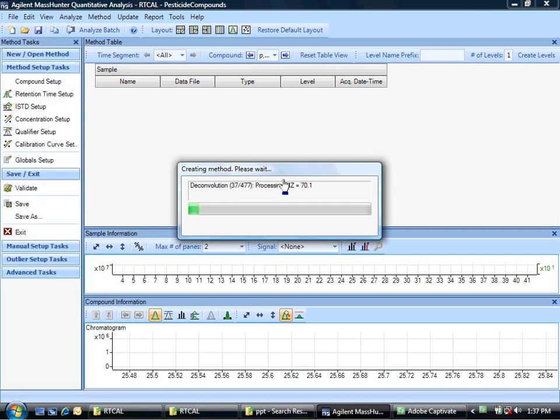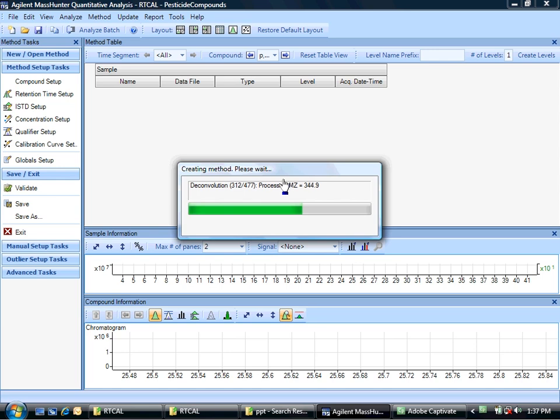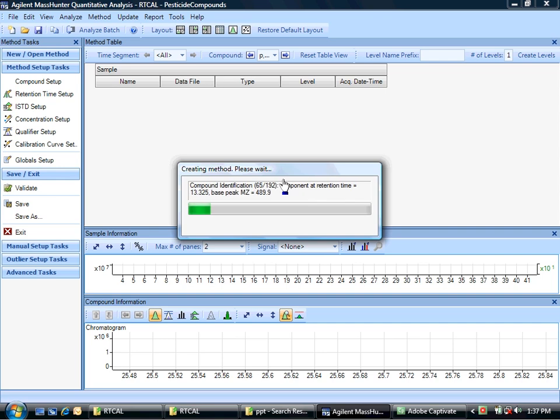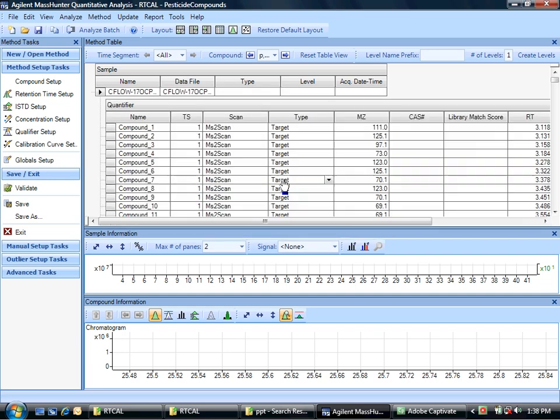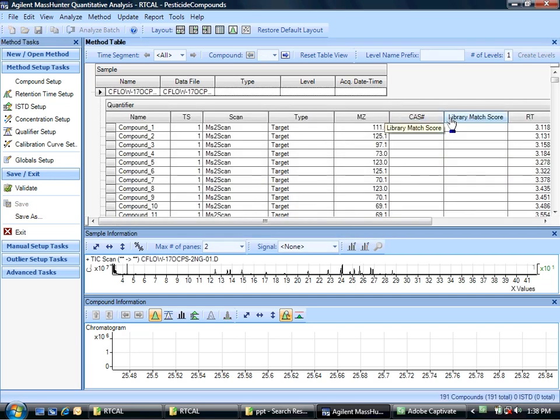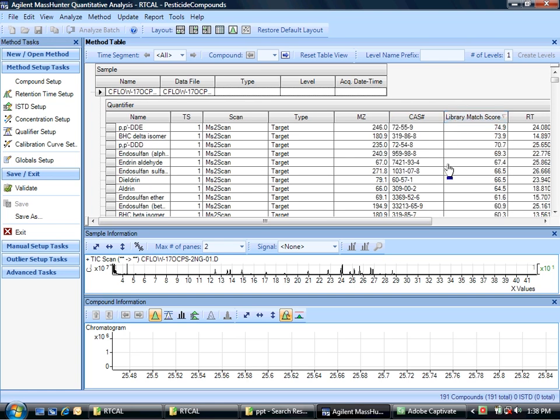So it's going to take that data file. It's going to go through and deconvolute the scan data, pulling out those spectra one at a time. And then when it's got those spectra together, it's going to go over to the library using not only the spectral match criteria and constraints, but also with the retention time and the retention time to retention index mapping using that criteria in the retention index window to come up with a list of compounds. So there it's finished with deconvolution. Now it's going to run through the library search and pick out those matches. And it's going to show us a list of compounds that it's found.